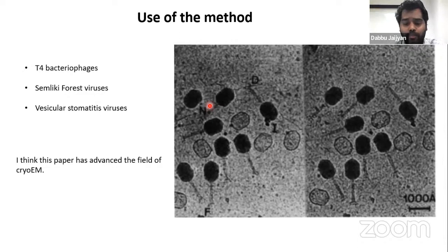So I think this is important because the previous technology, transmission electron microscopy or SEM, the biological material is dehydrated and fixed using a chemical like paraformaldehyde or glutaraldehyde, which can fix the sample and dehydrate it, removing the water molecules. But in this cryo-EM sample preparation, we are not removing any water molecules, because the water is a very important component of the organism and the cells, which maintains their internal structure.